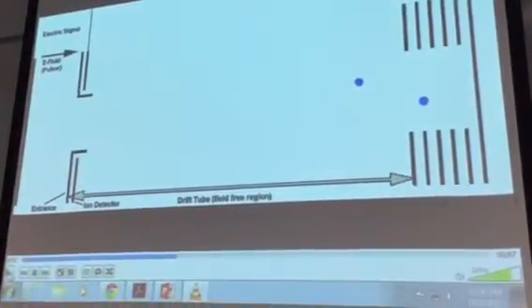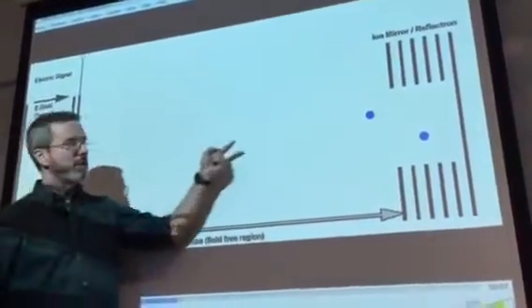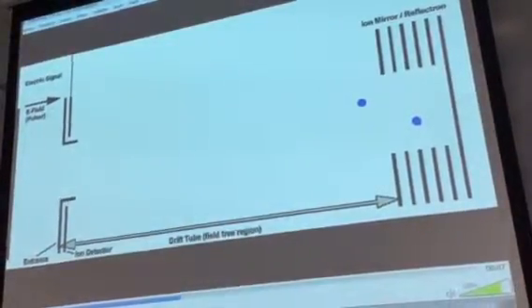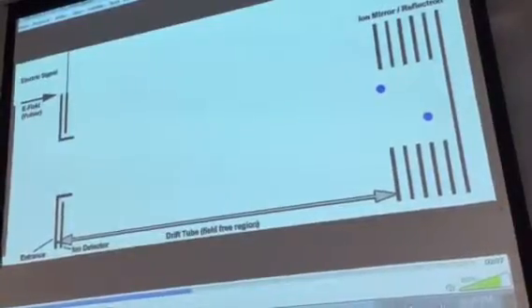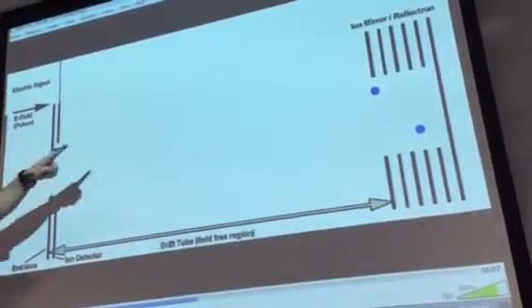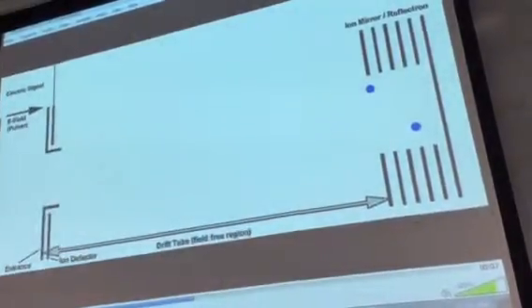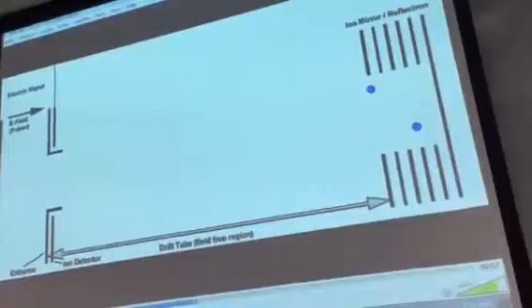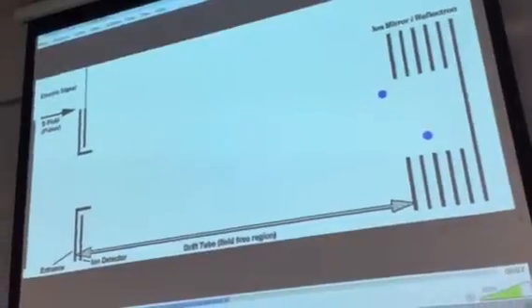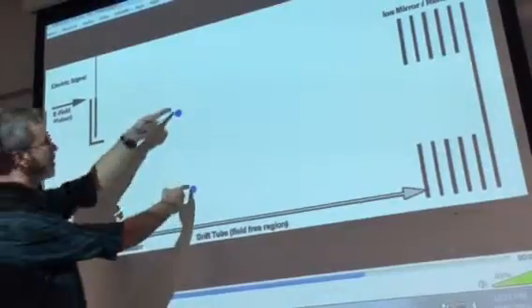The ion that was traveling a little faster actually penetrates this electrostatic well a little further. So it has to travel a little bit further before the electrostatic repulsion is enough to reverse its direction. As opposed to the one traveling slower, which had lesser momentum and didn't penetrate that electrostatic well nearly as far before it got reversed. Did you guys notice that? And so the one that was traveling faster had to penetrate further before it got slowed and redirected compared to the other. And now look how much closer they are to one another.